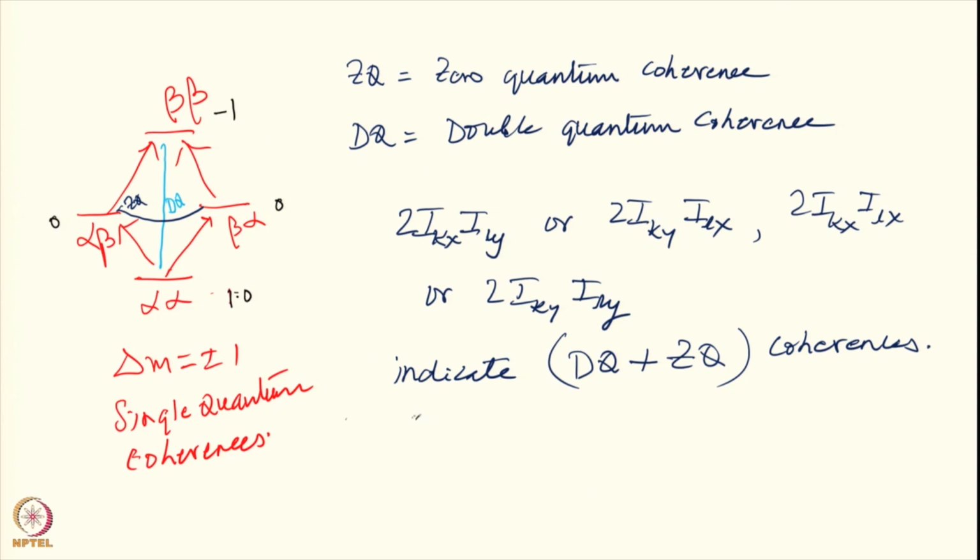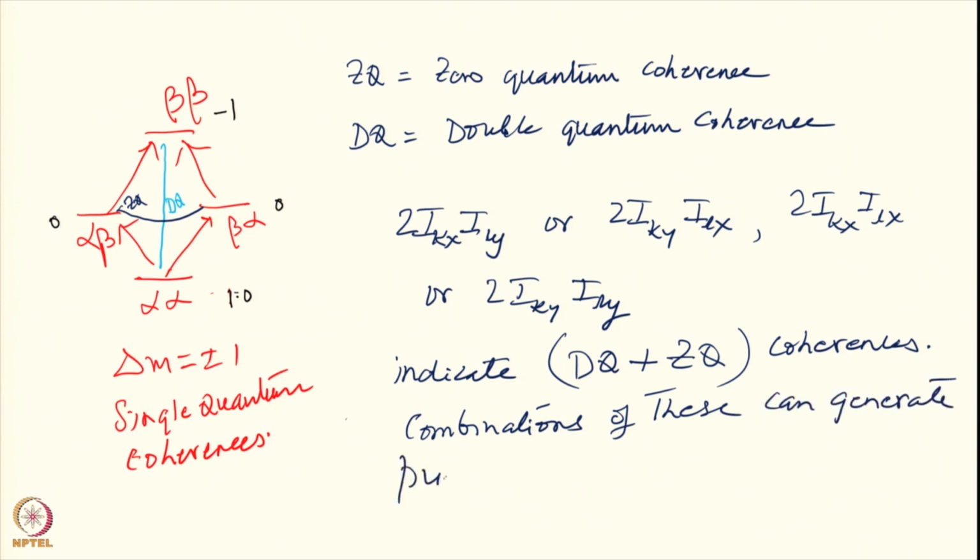Okay. Combinations of these can generate pure DQ or pure ZQ.